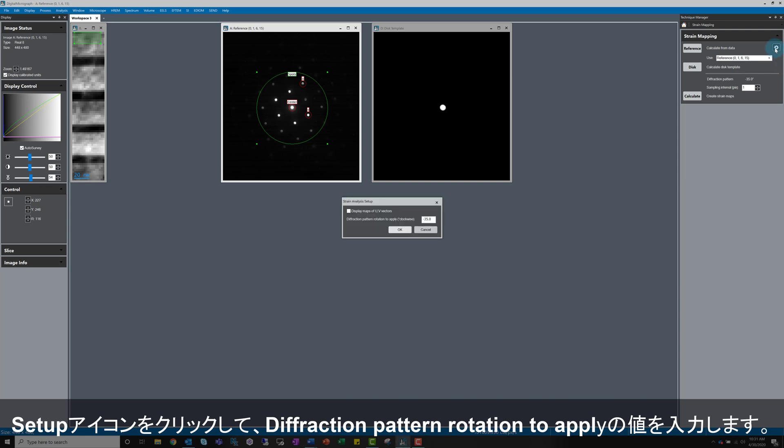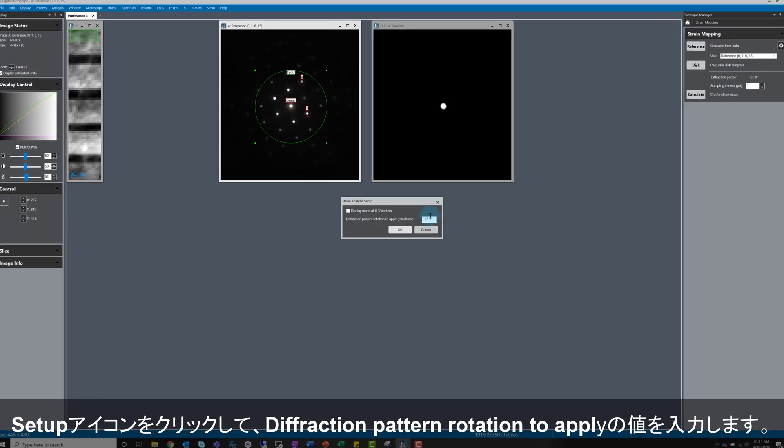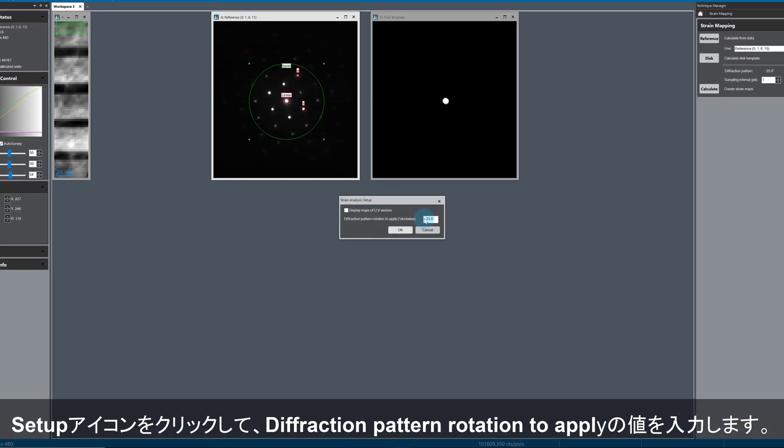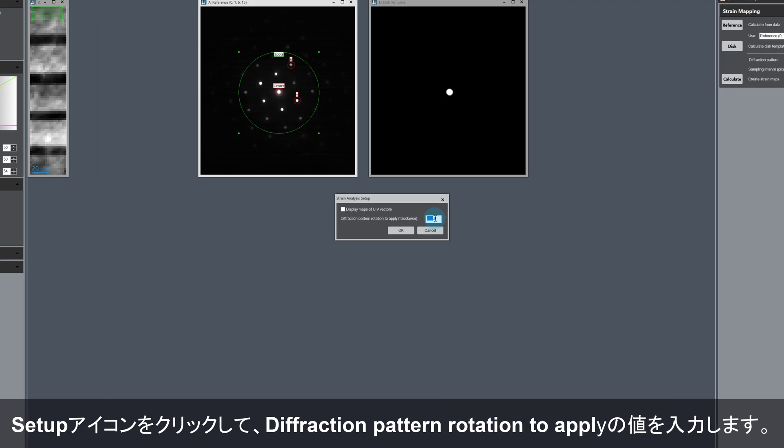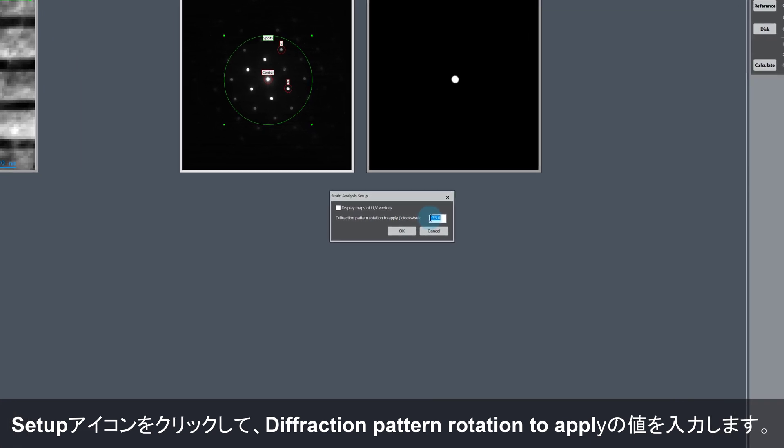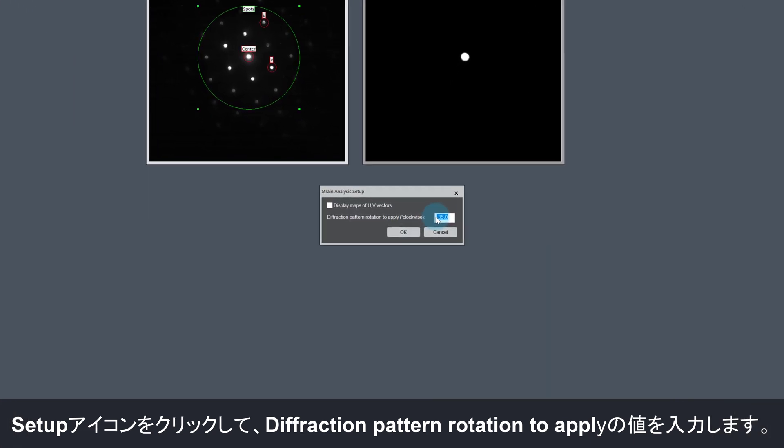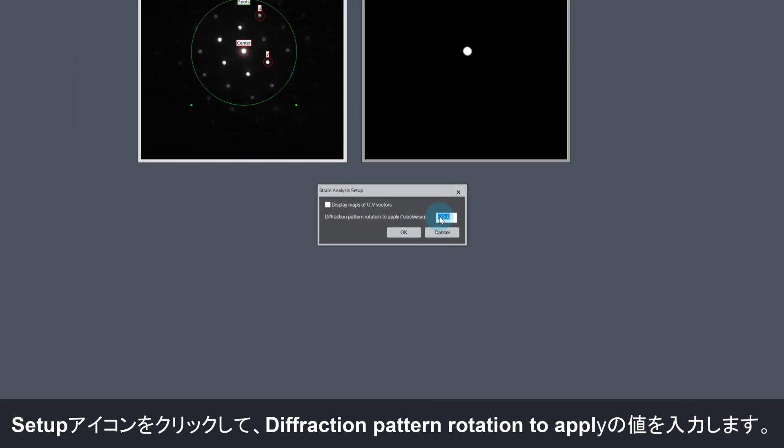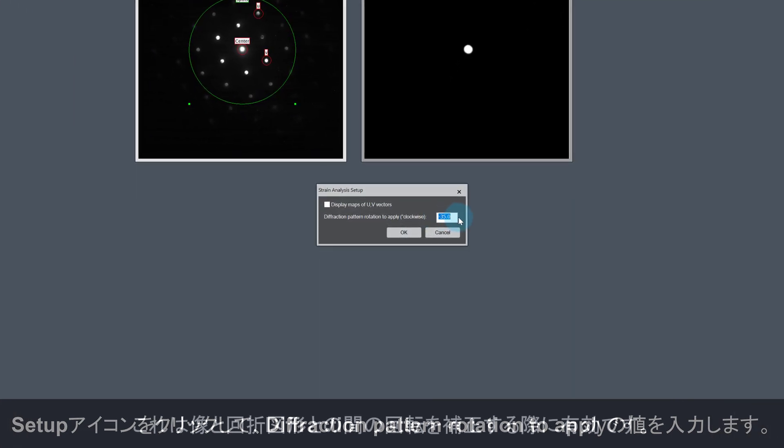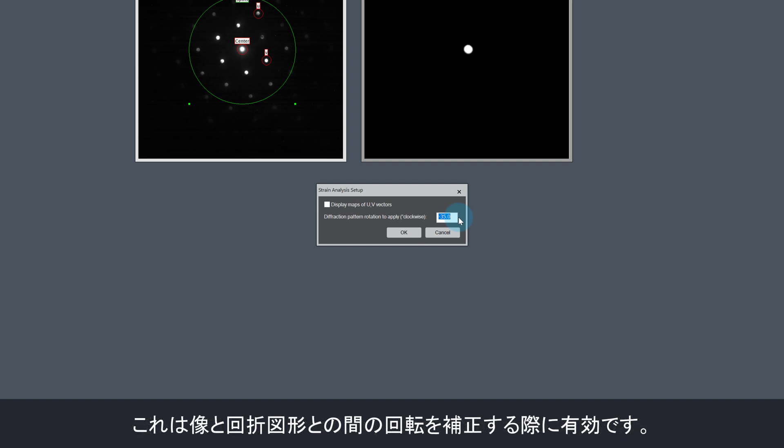If you click on the setup icon in the top right corner of the strain mapping window, you can enter the diffraction pattern rotation angle. This is useful because in most cases there is a rotation between imaging and diffraction modes in the microscope.